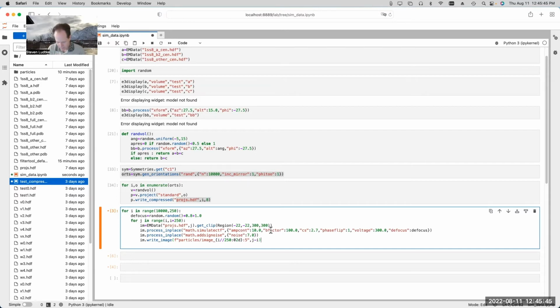So if anyone sees anything here which they think I missed, tell me. And if anyone has any questions about any of this, ask. That's what this is about, right? I'm just impressed that you did it so quickly. It's sort of taken me a second. So I've been doing this for a long time, unfortunately.